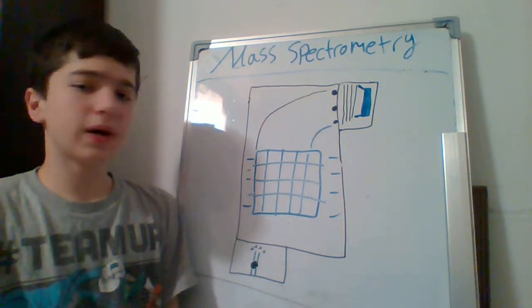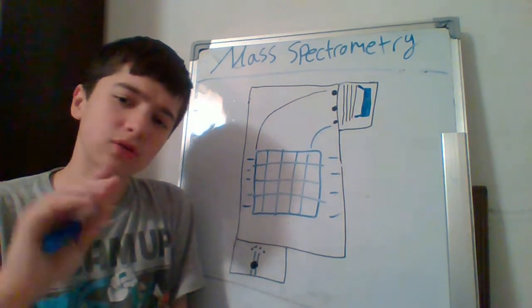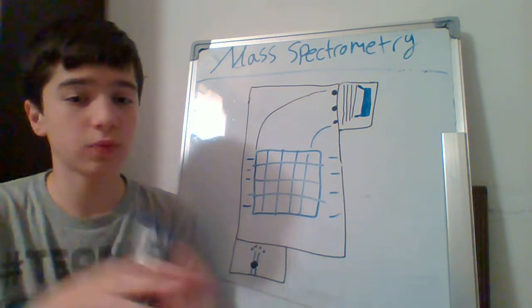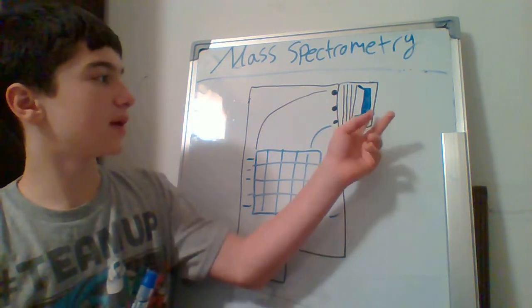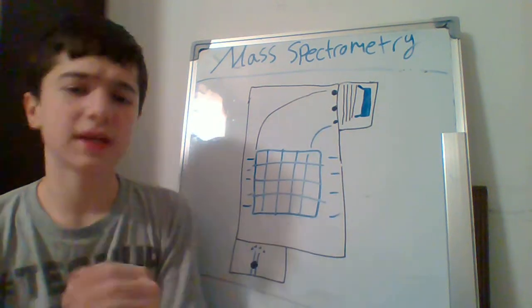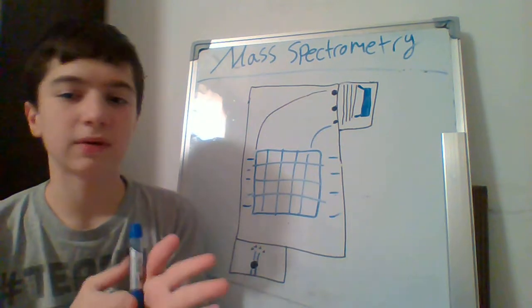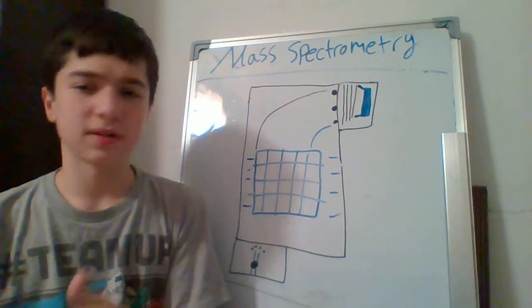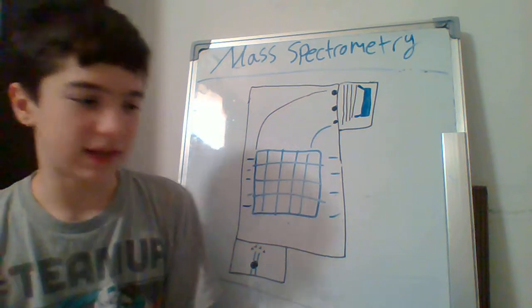So the electron multiplier, what is its job? When electrons touch that electron multiplier, any electron that touches it, the electron multiplier will spawn more electrons, and keep spawning until we reach the last part, and then we're going to be left with the ion hitting that amplifier. We get that signal to the computer and the computer does everything and gives the analysis, where we know the composition, the empirical formula, and also the purity of that sample.